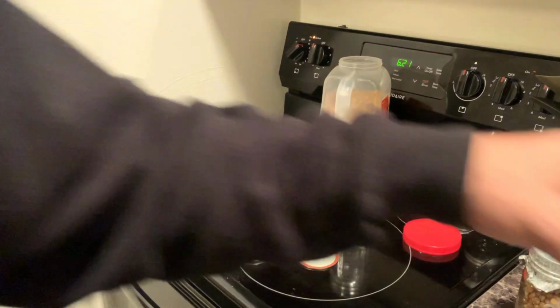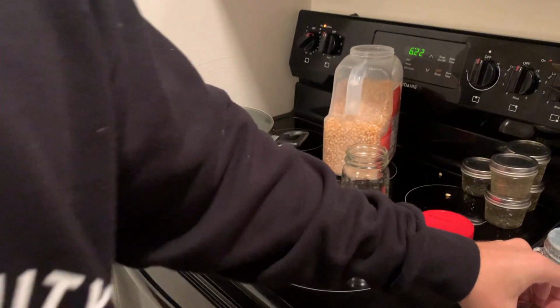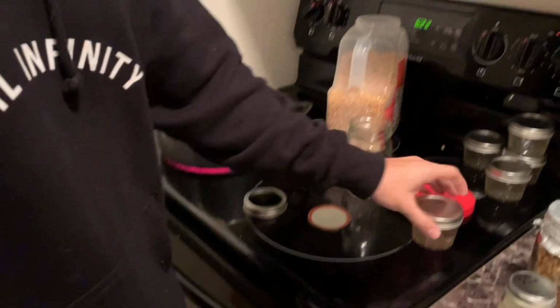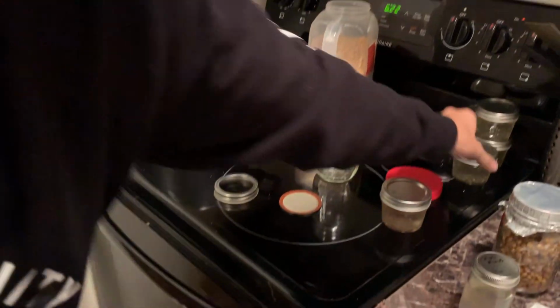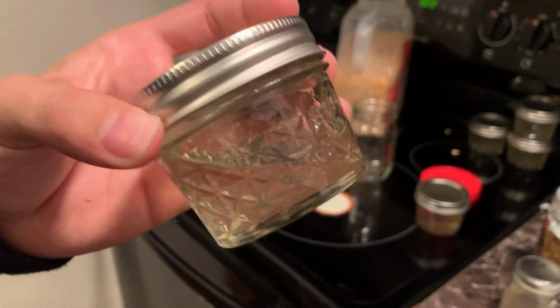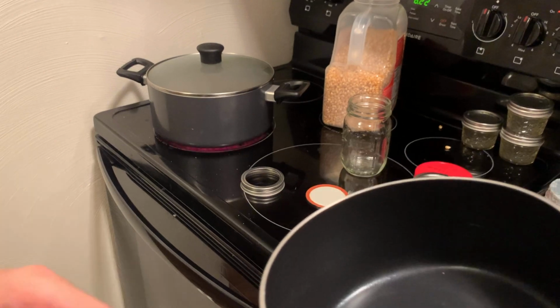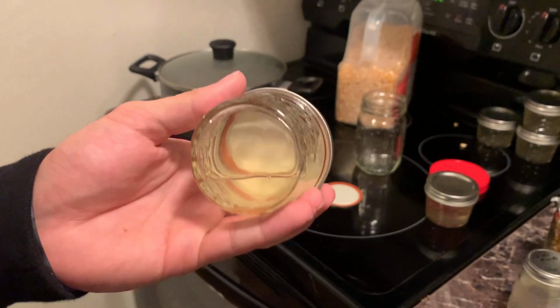Also, we can go over how to make liquid cultures. You guys can see the, maybe, mycelium floating in there. Basically, I like to use these 4-ounce jars. Doesn't really matter what brand, but you just take a smaller pot, measure it out, however many jars you want, throw that in there, and then for every 4 4-ounce jars, 1 tablespoon of honey. You just boil that down, jar it up, and then throw it in the pressure cooker for 90 minutes. And then these are good to go.